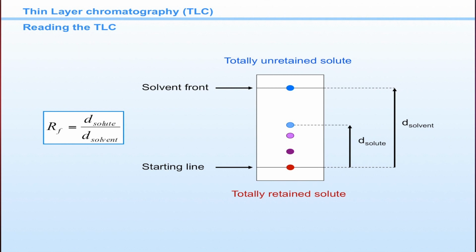Now you must know how we are going to do this TLC, which can be generally done in our laboratory itself. You are going to use the silica gel as your stationary phase, which is an adsorbent. Nowadays the silica gel, this is the TLC plate, is available ready-made. But before, you can take a normal glass plate. To that you are going to add your silica gel. How? The silica gel, which is in powder form, is mixed with water in the ratio of 1:2. To that you are going to add calcium sulfate, which acts as a binder. This binder makes the silica gel fix to the glass plate.